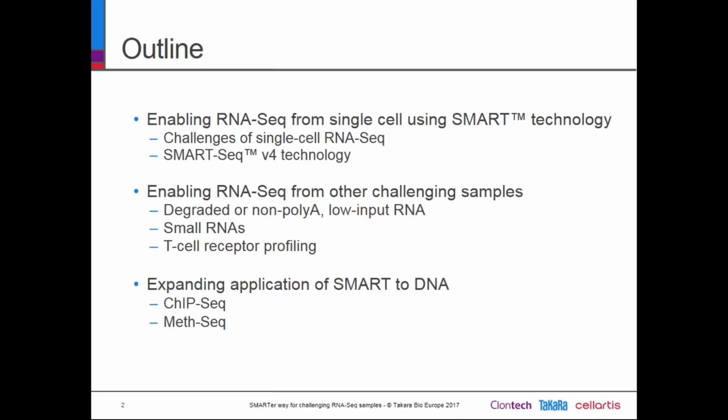Then I will discuss how this technology can also be applied to other challenging samples like degraded RNA or ultra-low input RNA, small RNAs, and T-cell receptor profiling. And I will finish by briefly discussing some applications of this technology to DNA.